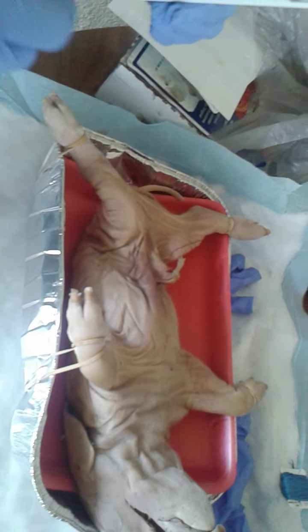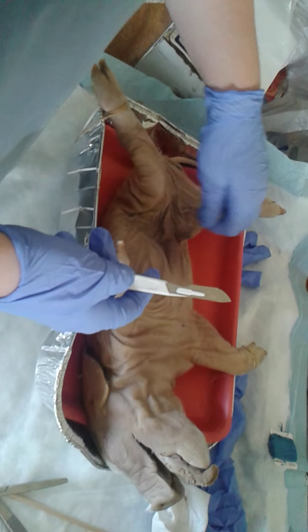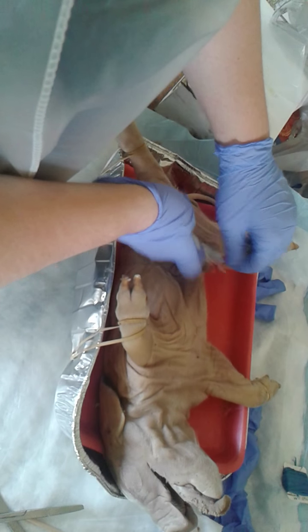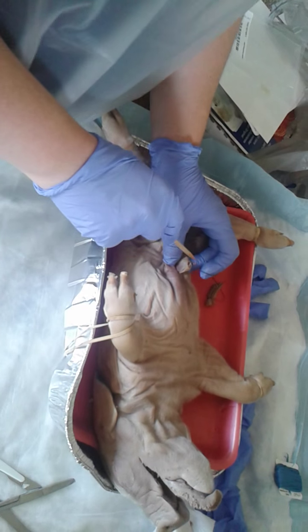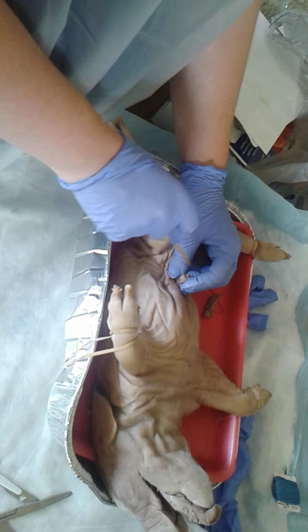I'm about to start the internal anatomy parts. I already have it strung up — got that before I started. This is the umbilical vein. Bring it closer — right there. That's the umbilical vein.